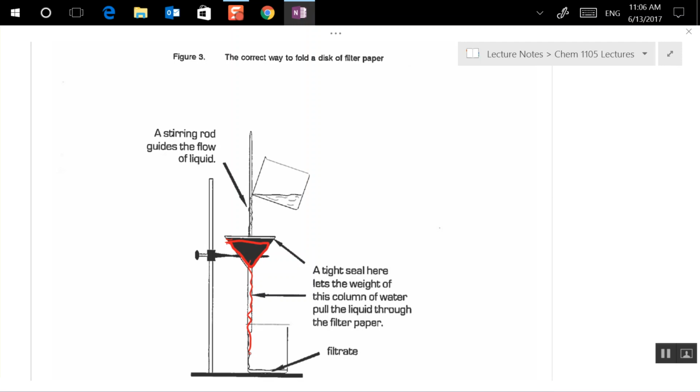It'll leave the mixture, and you'll separate it into here. Okay, and then you can look at the things that are left over, which are neither water-soluble nor acid-soluble. And then you can make a conclusion about all the components of that mixture.